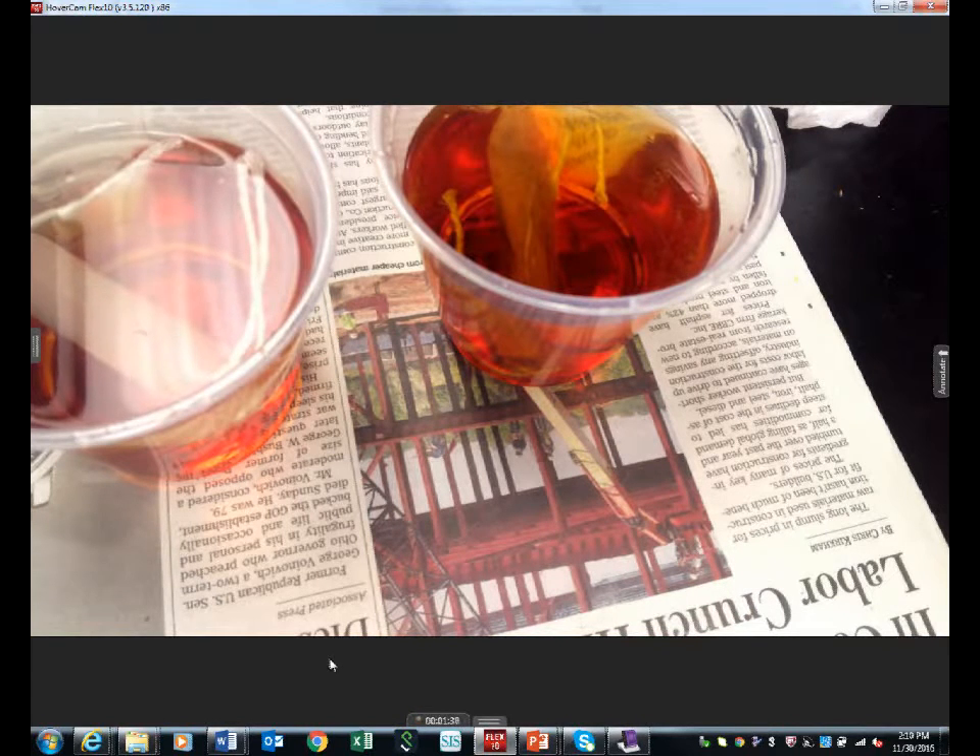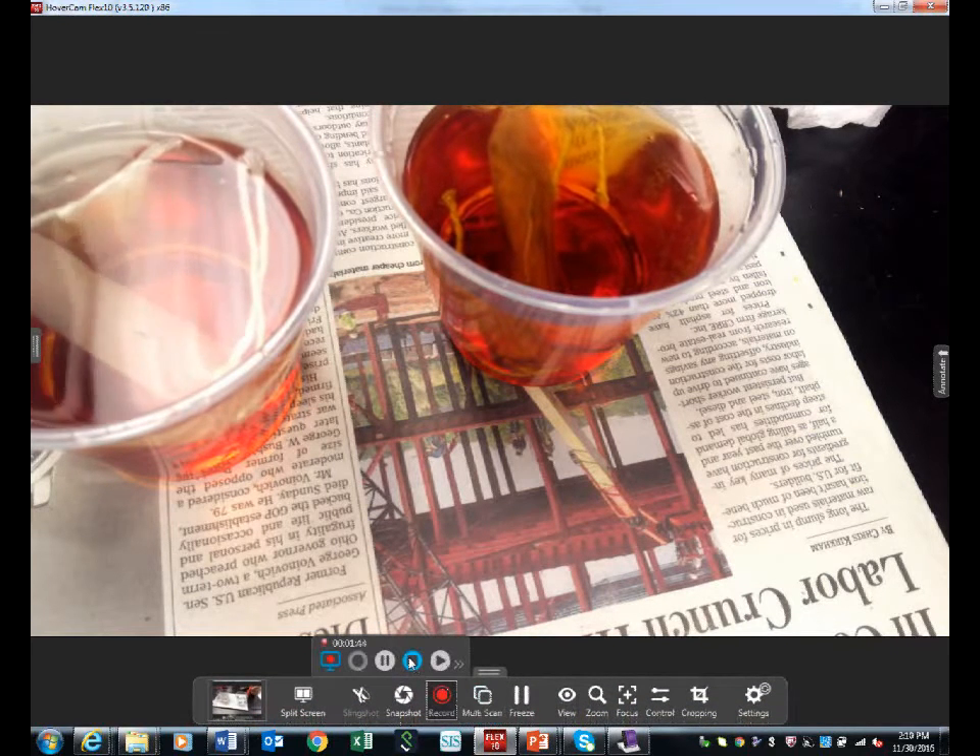All right, so now we play the waiting game and start thinking about what we're going to do next. Think about: is it permeable or impermeable? Is it diffusion or osmosis?